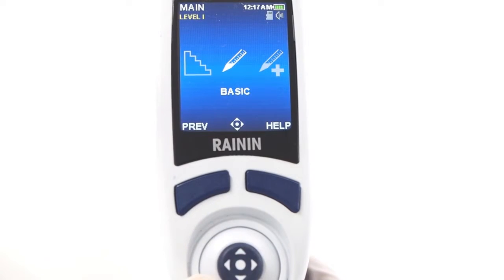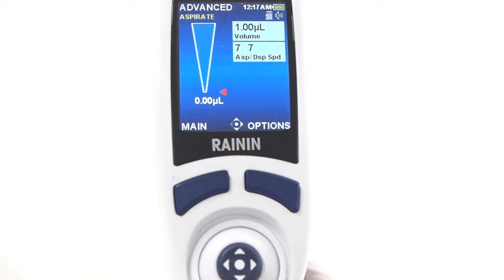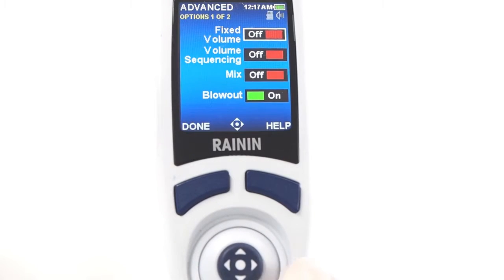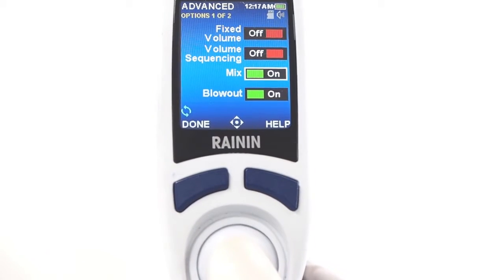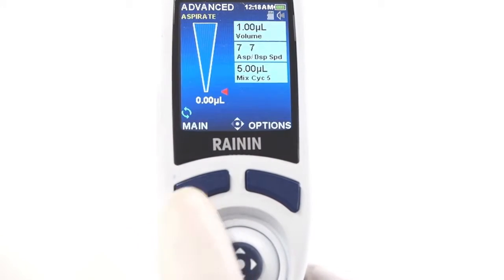Modes on the E4 give you a variety of pipetting options. For example, in advanced mode, press options in the lower right. This opens a screen of on/off switches for options like mix, volume sequencing, and others. Let's take mix as an example. Press in to turn it on, then press done.